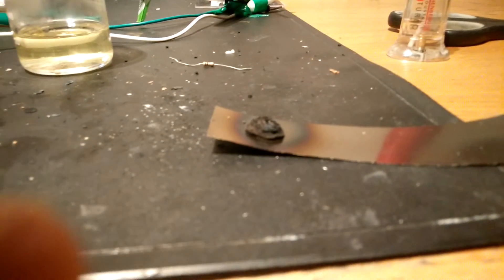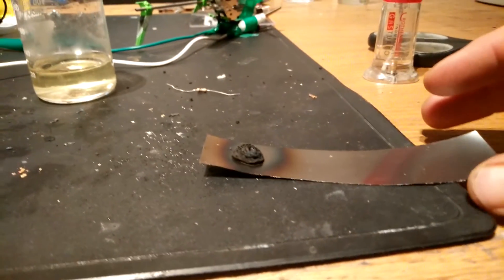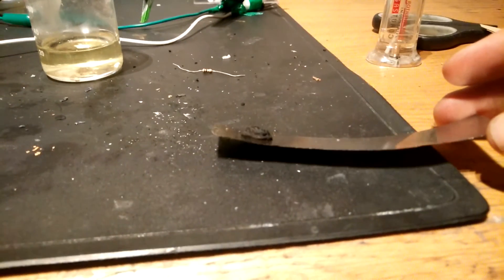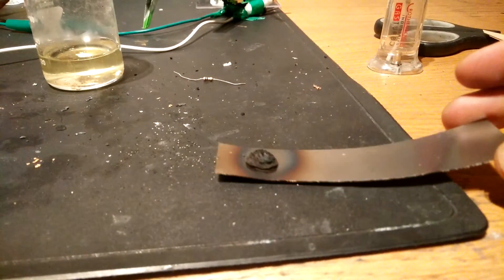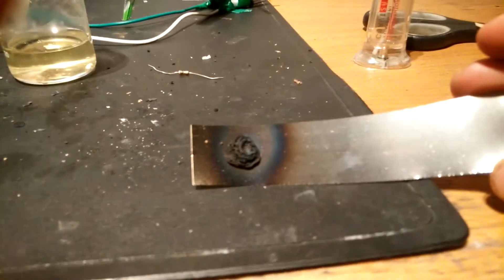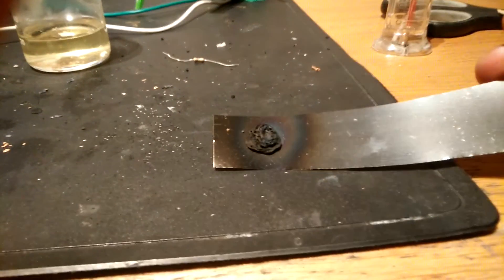Try to make a focus on it — yeah, now you see. Just from this small drop of solution. Looks like a flower.